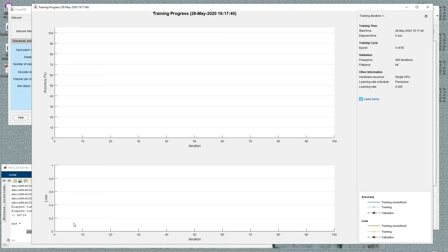It should be minimized towards 0, and that's what is more interesting to follow. So we started. You see it started at 80 because there's plenty of background, so it's already kind of trained well. But what's interesting is to follow this loss function. Technically, we want to minimize it as low as possible, and it's going to fluctuate.